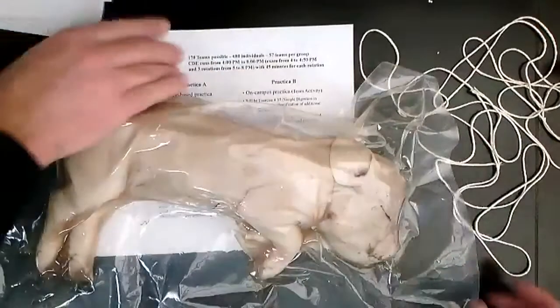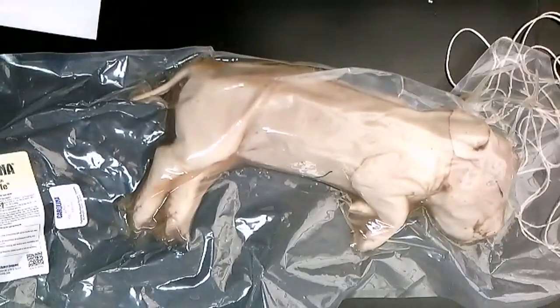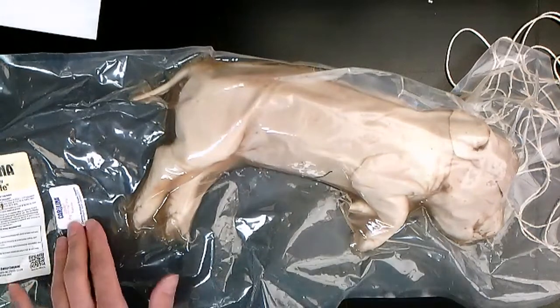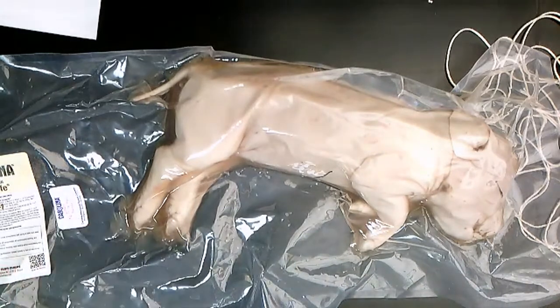Okay, so one thing when you're preparing your team, or hopefully you're doing this with your whole class, I want to show you the fetal pigs that we're using. The fetal pigs that we are using this year come from Carolina Biological, and we've decided that we are going to use large fetal pigs. This is pigs that are 11 to 14 inches. So they're going to be very large.